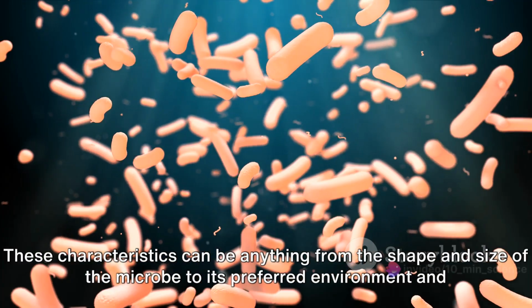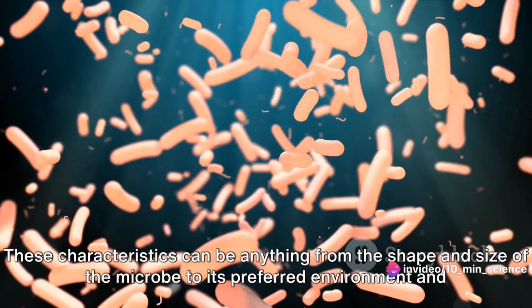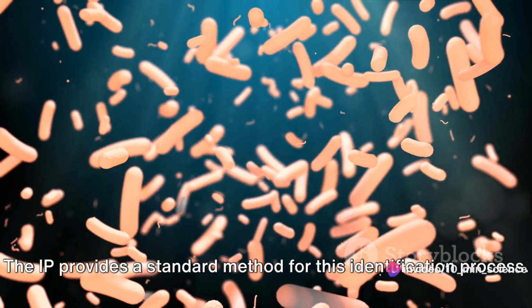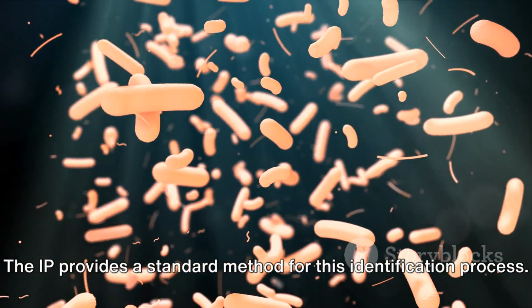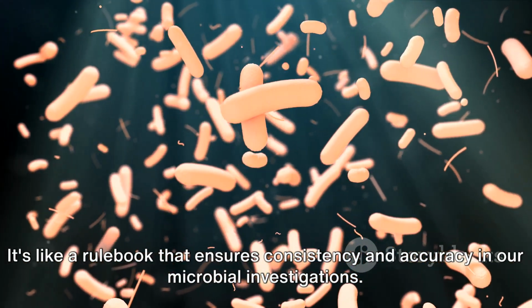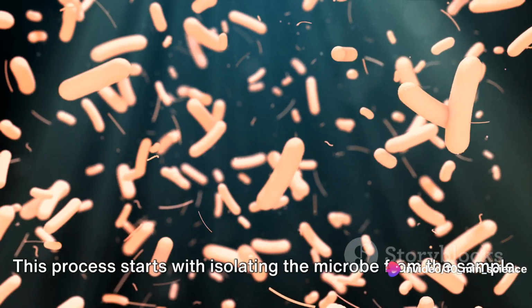These characteristics can be anything from the shape and size of the microbe to its preferred environment and nutritional needs. The IP provides a standard method for this identification process. It's like a rulebook that ensures consistency and accuracy in our microbial investigations.